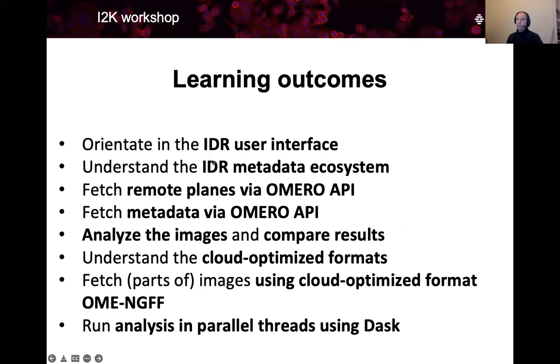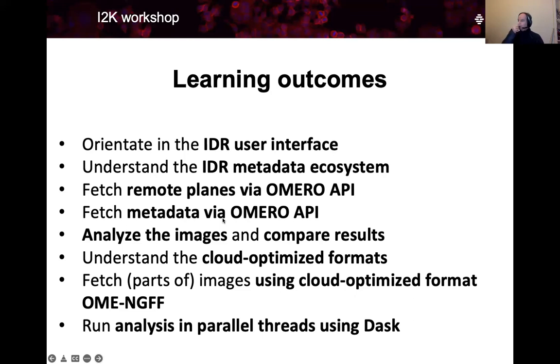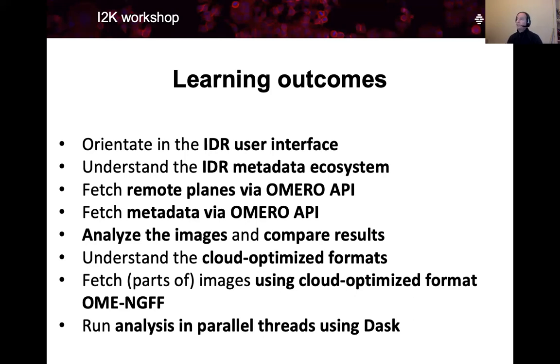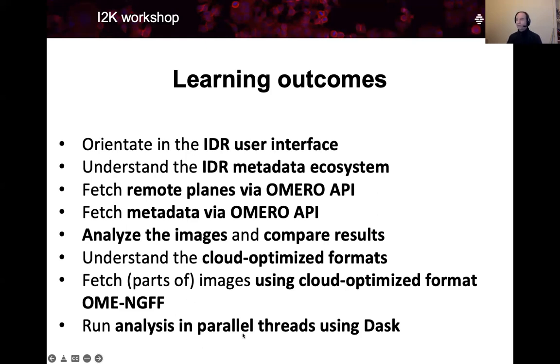What we will learn in this workshop is first we will orientate in the IDR and its metadata ecosystem, then we will programmatically fetch the image planes and metadata using the Omero API. Then we will learn how to segment the fetched images in Python environment and compare results with the original results coming from IDR. We will understand what cloud-optimized format is on an example of OME-NGFF, and then we will run analysis in parallel threads using the Python library Dask.